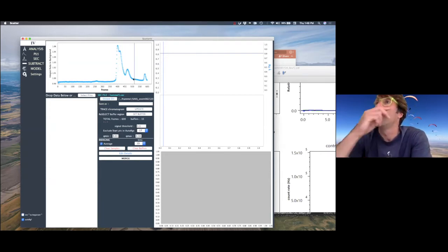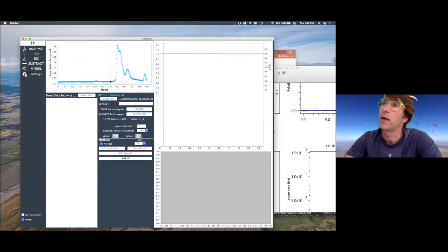Okay. So now, as I think Rob mentioned a couple of times, when we have higher concentrations, we have this capillary fouling, where the background before the sample and after the sample are different. How to deal with it?